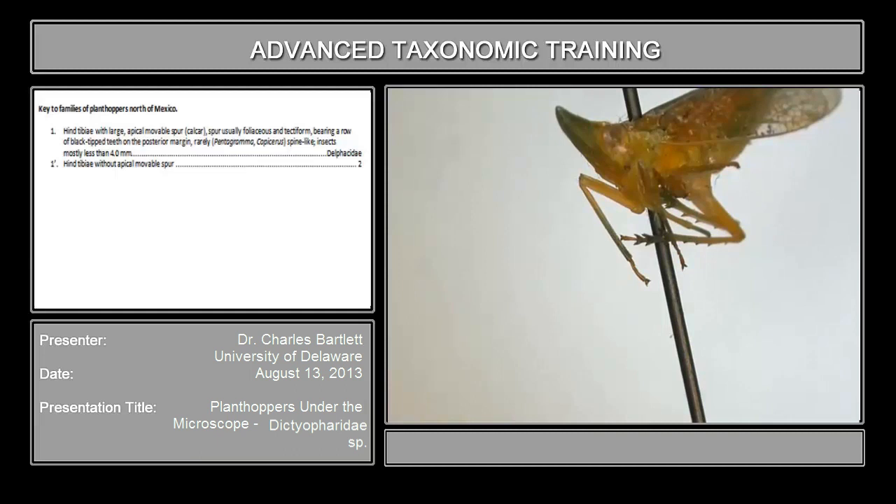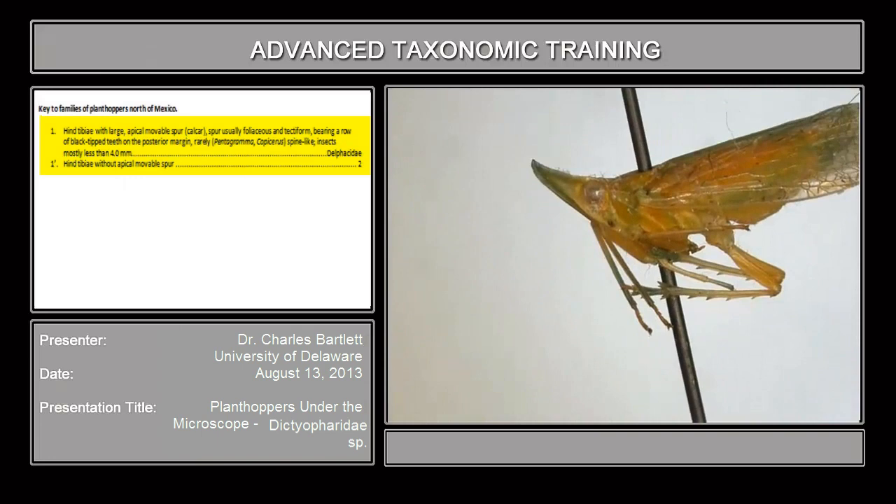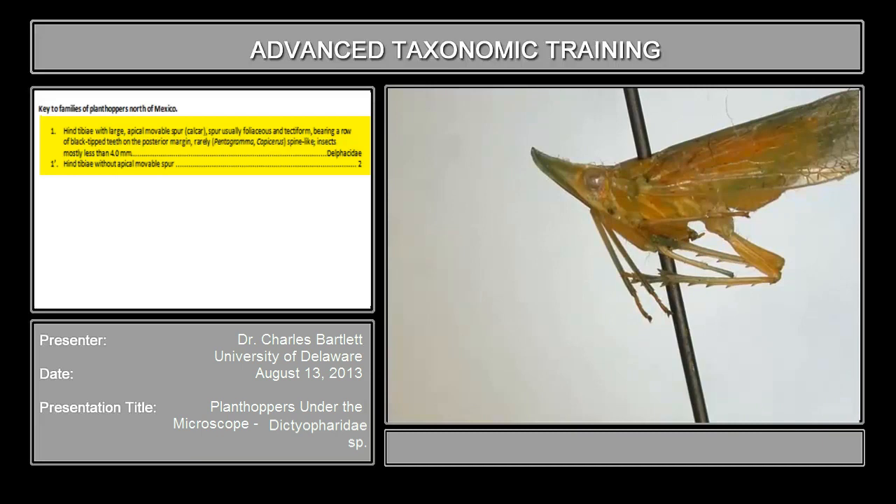I believe I gave you a specimen that looks something like this. Beginning again at couplet 1, right here is the hind leg — this is the tibia, you can see those lateral spines. There's the first tarsal segment and the second tarsal segment of the hind leg. Right here is the apex of the tibia, and the first couplet reads 'hind tibia with large apical movable spur.' This specimen does not have an apical movable spur.